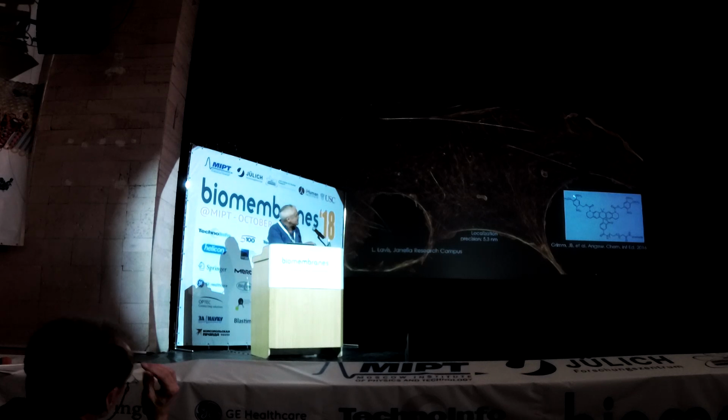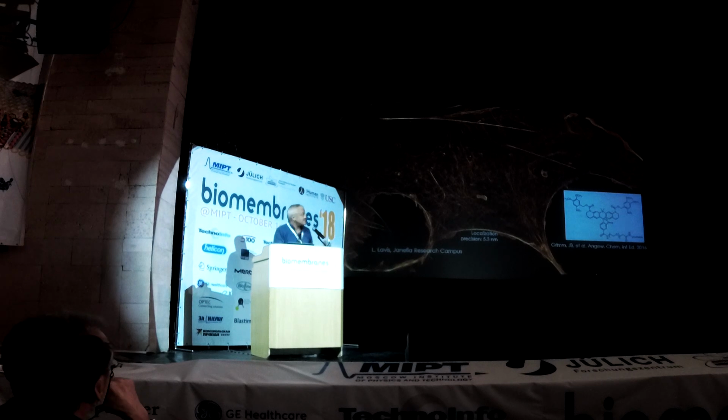and then these bonds cleave off, and the fluorophore reforms, and then you have to photo-bleach the fluorophore, localize it, photo-bleach, activate, localize, photo-bleach. So it takes some time, this image, about 6 hours here. It's a very slow technique, but then you end up with a localization precision of 5 nanometers.